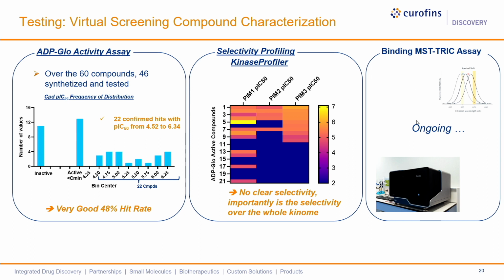Unfortunately, the MST-TRIC binding, the MST-TRIC spectral shift data are not available today. They will probably be finalized next week, but I'm quite confident we will confirm at least the 22 compounds.